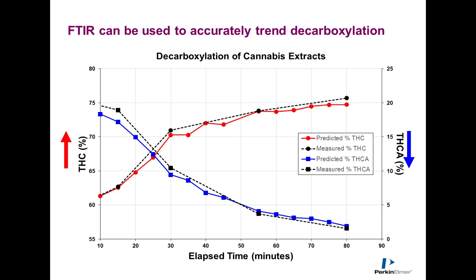And here we can see data from experimental and also from the model that show excellent correlation. So moving forward, there's now a fairly elegant, quick instrument option for looking at the decarboxylation of THCA to THC.